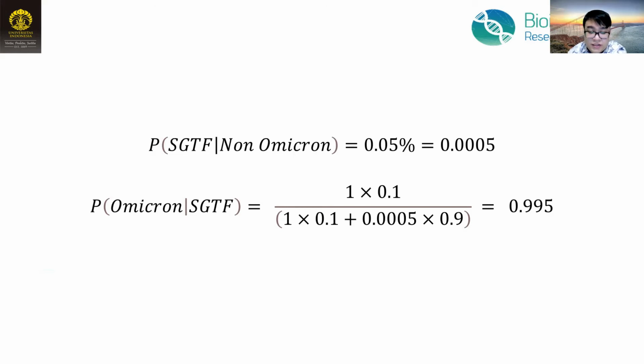From this calculation, we can conclude that the SGTF is most likely caused by the Omicron variant. However, sequencing is still needed to confirm that the infection is caused by the Omicron variant.